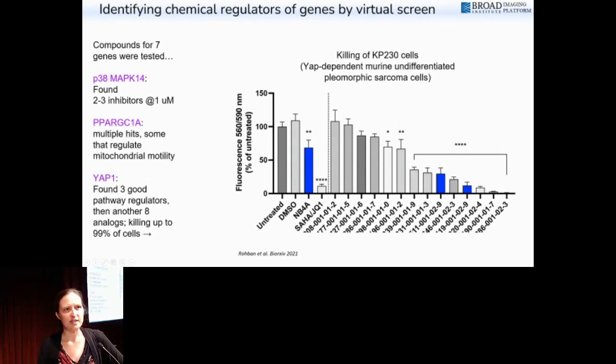When you treat cells with a compound, he's referring to off-target effects, which means even with FDA-approved drugs, much less regular chemicals that people have synthesized, they're often very unoptimized. In other words, you add the chemical to the cells, they might attach to multiple proteins and then have multiple effects, some of which you would call on target because they're what you wanted, and some of which are off target, which you wish did not occur.